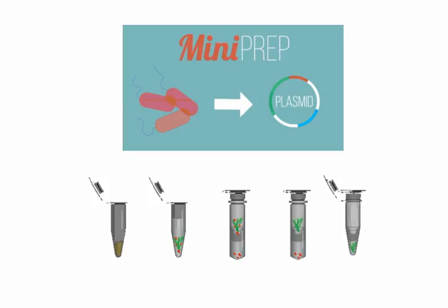This is a lab skill that is present in many biotechnology labs, so they're going to get the exposure of actually doing some real-life biotechnology and not just stuff that happens to be from a kit. In fact, another way to look at this is they're making their own kit here, and they're essentially making the kit for the following year's class. So I'm not going to go too far into the process of the mini prep, but if you have any questions, you're more than welcome to ask me.